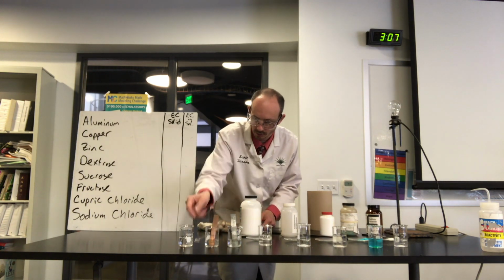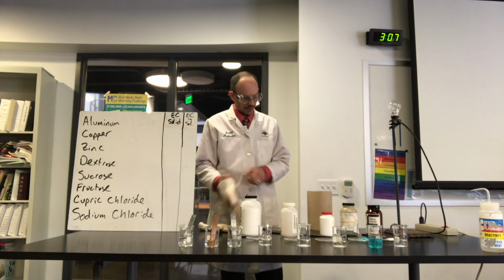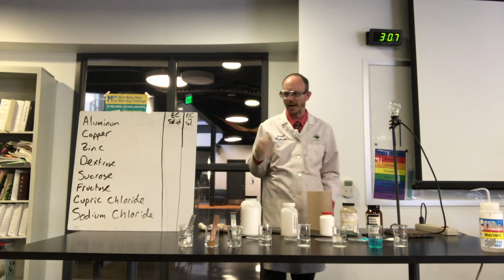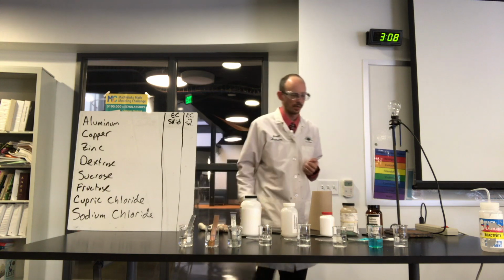And then we'll add my metals too. They shouldn't feel left out. All right, so let's go in reverse order this time. So we're going to go from bottom of the list up to the top. And now we're looking at this final column right there.